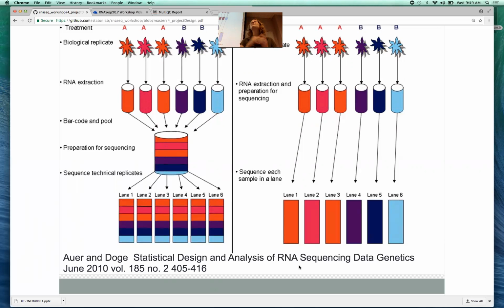Yeah, so you could randomly assign your controls and treatments to lane 1 and 2. So you would just block out the lanes. If it wasn't feasible to sequence every sample on both lanes, just don't divide them between control and treatment; randomly assign them between the 2 lanes so that you've controlled for that. Does that make sense? Yeah, 46 in one, 46 in another. Yes, or block out half my controls in this lane and half in this lane, and half my treatments in this lane, half my treatments in this lane.